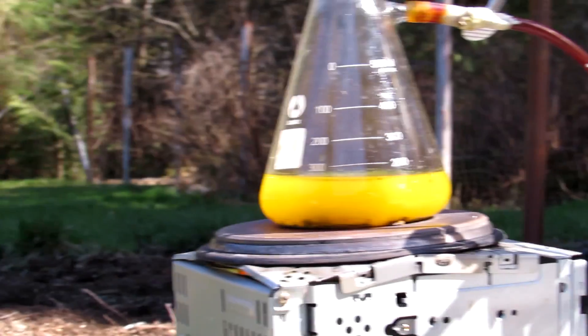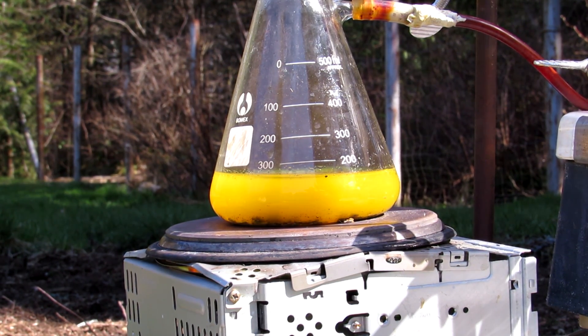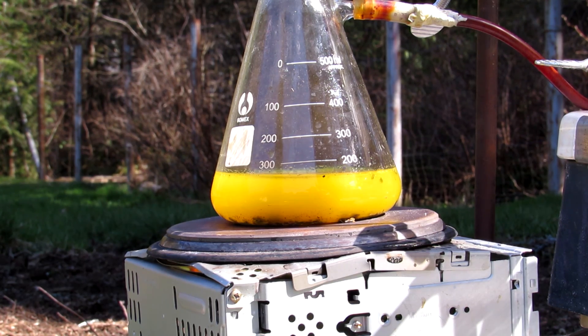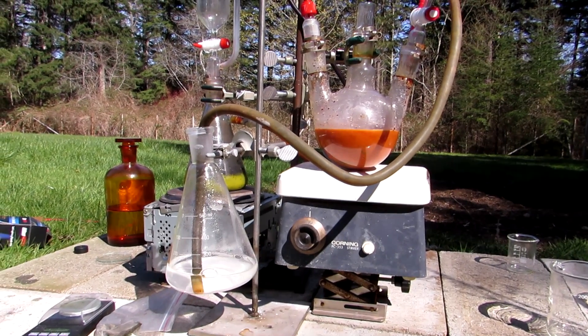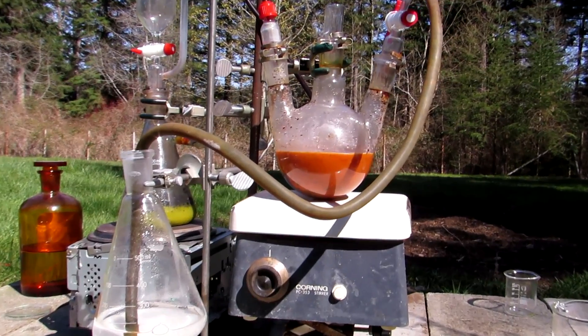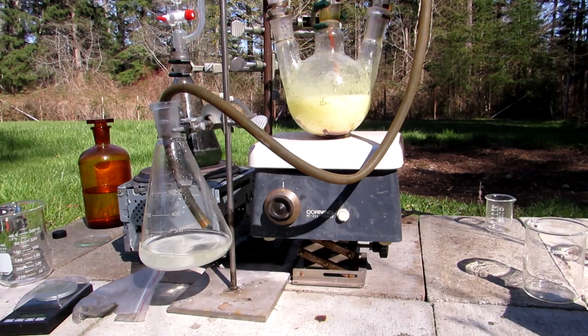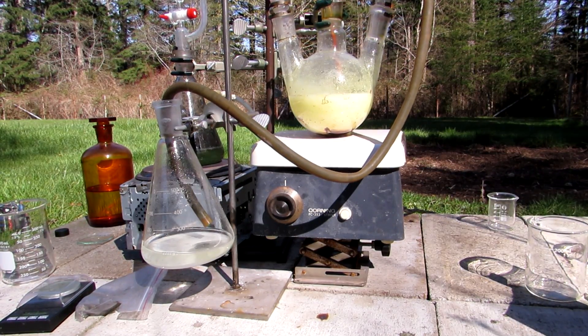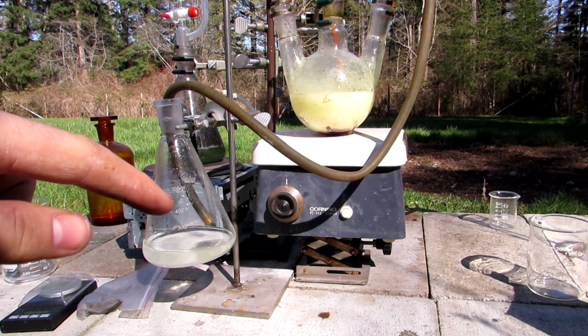Interestingly, the solution with the iron sulfide became yellow, indicating iron(III) was in solution. This was surprising because iron(II) chloride was expected to form, which produces pale green solutions. As the hydrogen sulfide reacted with the iodine, the solution color lightened from the formation of suspended sulfur. Once all of the iodine is consumed, the hydrogen sulfide generation can be stopped and the outlet tube can be removed from the baking soda solution to prevent suckback into the flask.